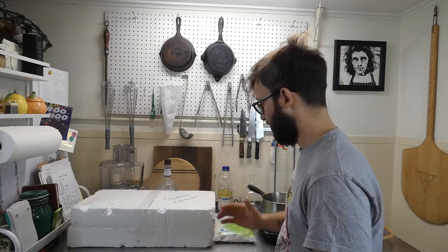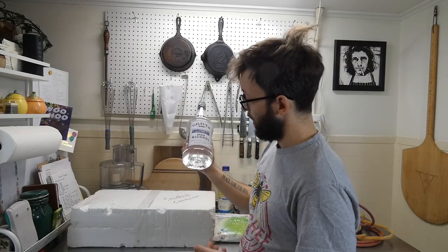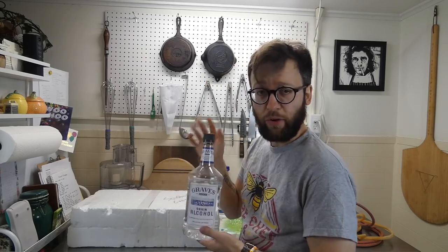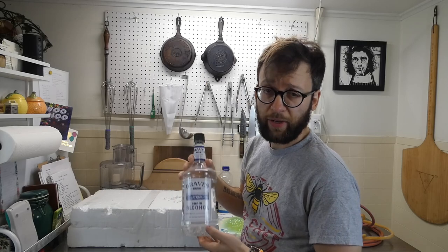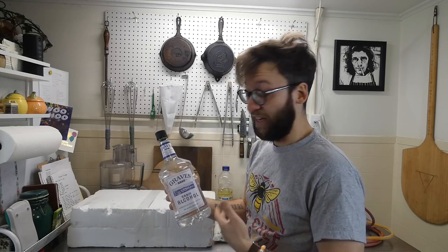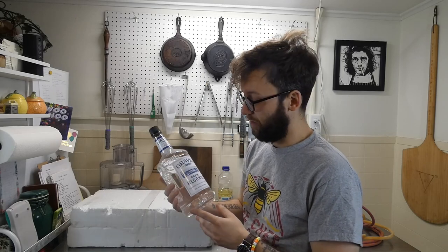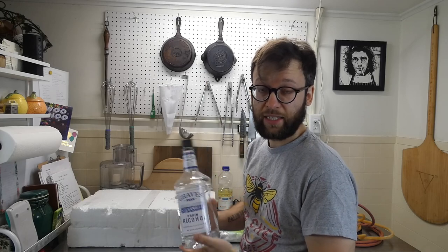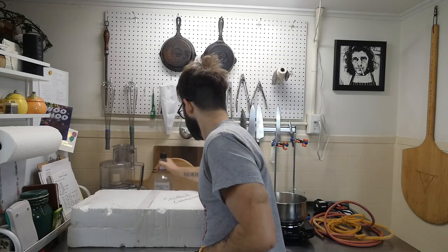All right, so as you can see behind me, we have an array of objects that we're going to need for this extraction. So let's just get right on to the list. So you're going to need grain alcohol, or ethyl alcohol. In the state of Vermont, you need a permit in order to purchase this. I got a permit. It's free. You don't need to pay anything to get the permit. And then the Department of Liquor Control in Vermont calls the liquor store that you request and tells them that you're all good to go. So you're going to need that.